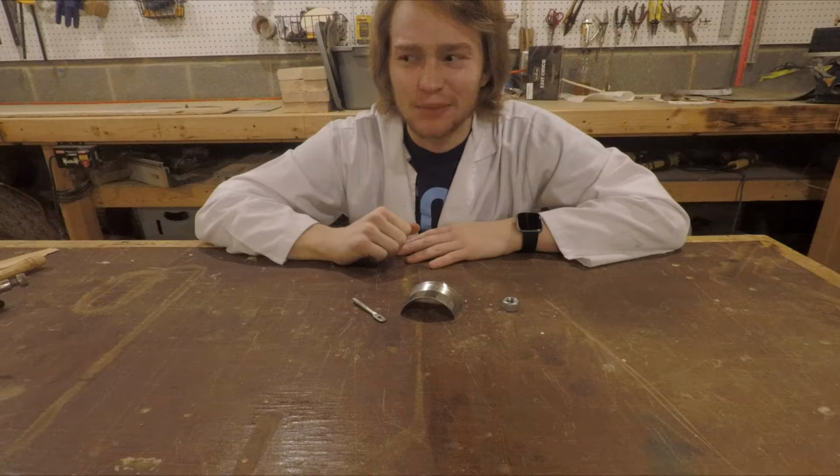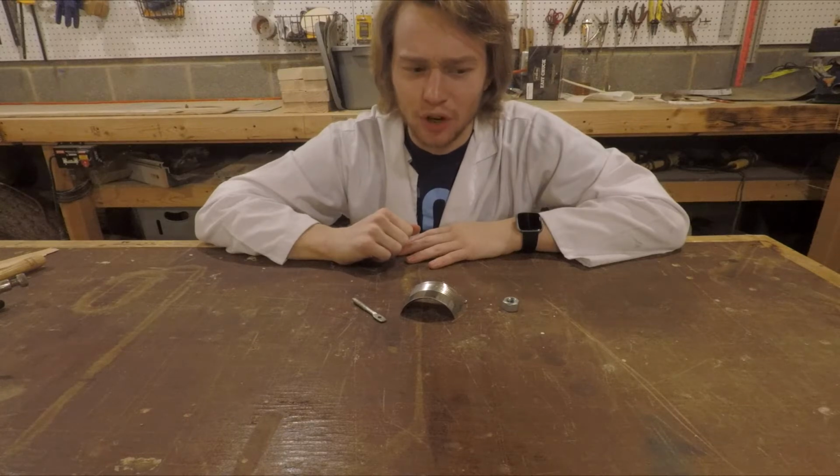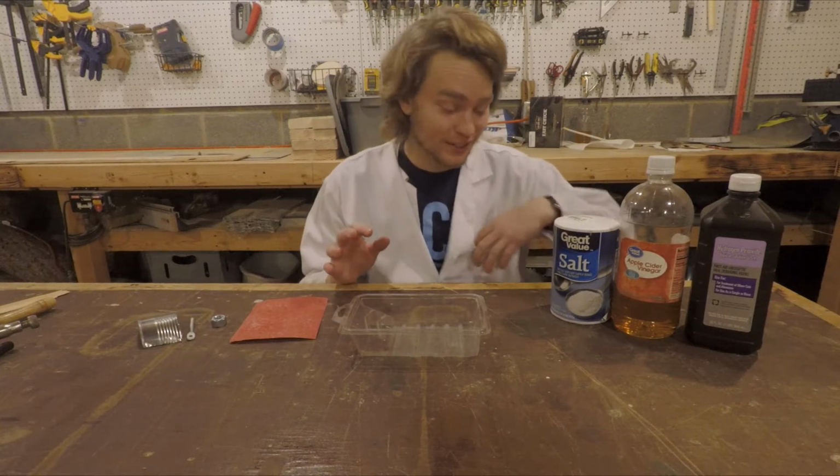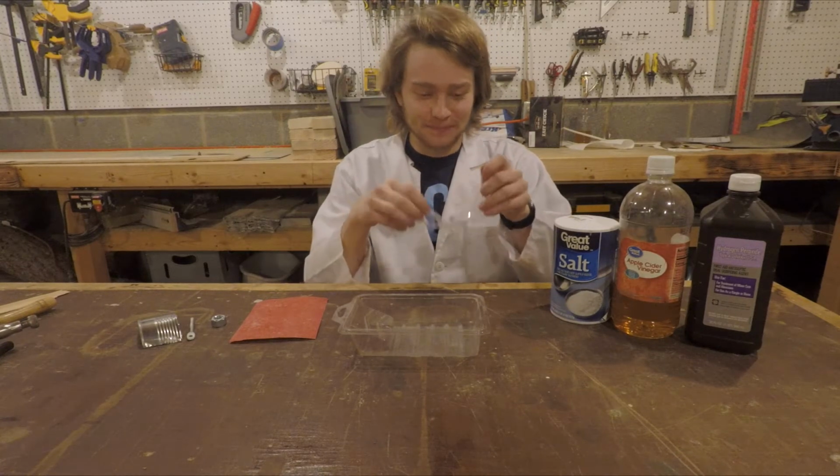Actually, on second thought, this is probably going to take too long. So let's speed up the process. Okay, so now we have different chemicals and it's time to put on safety glasses.